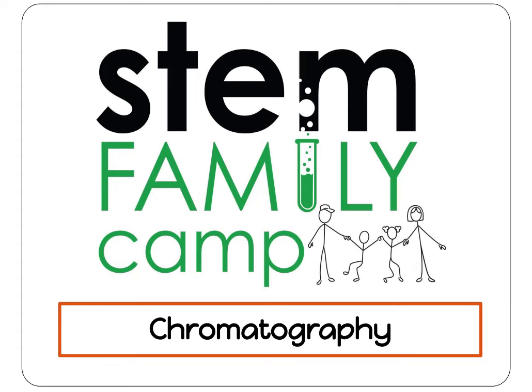Today we will be investigating methods for separating mixtures. We will be using the physical properties of different materials to separate them from each other. Then we will learn how to use two different chemistry techniques, paper chromatography and column chromatography, to separate food dyes from a solution like chemists.